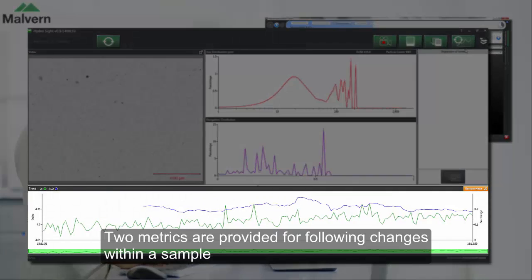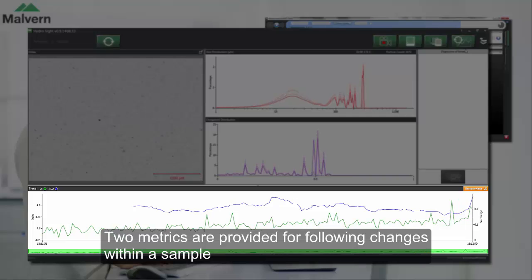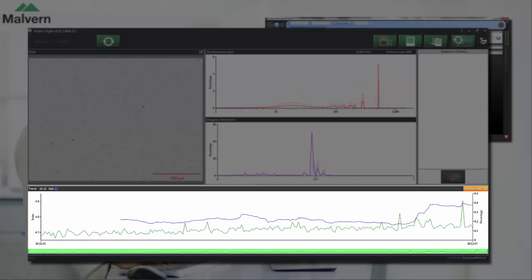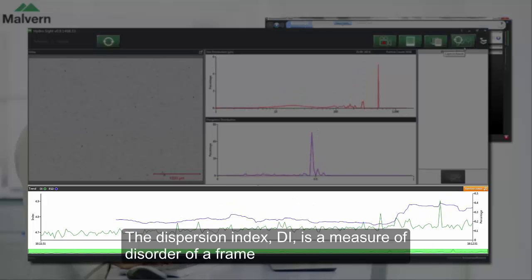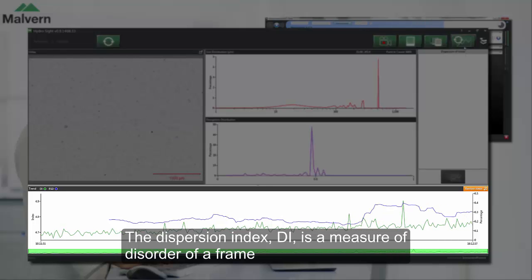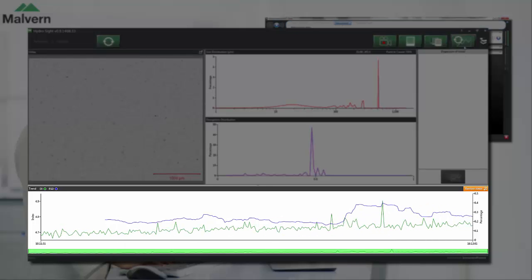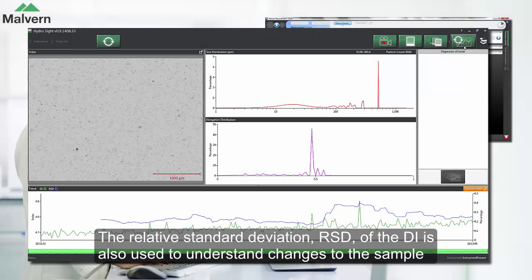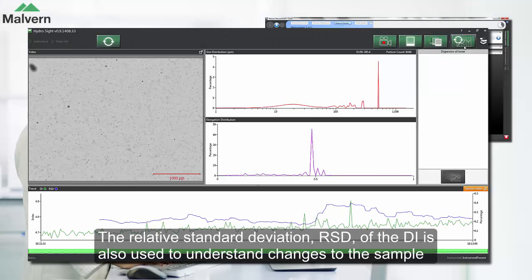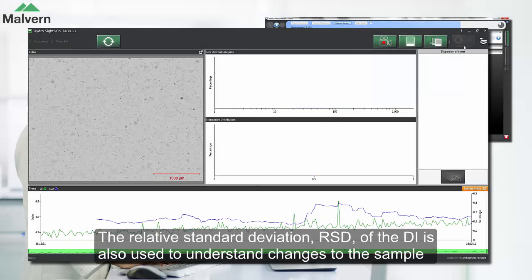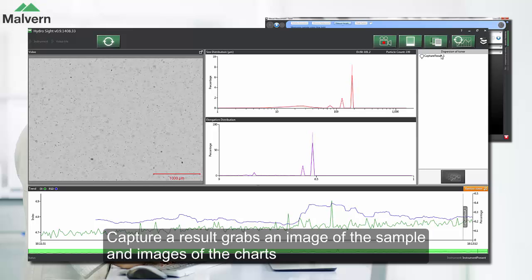The HydroSight software also provides two metrics for following changes that might be happening to your sample. Firstly, the dispersion index, which is a measure of the disorder or the busyness of a frame. We also use the relative standard deviation of the dispersion index to help us understand what might be happening to a sample.